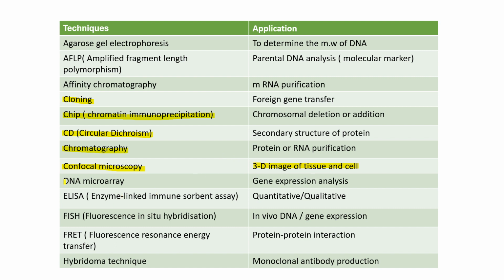And then DNA microarray for the application of gene expression analysis. Okay, how gene expression analysis can be identified by the DNA microarray.